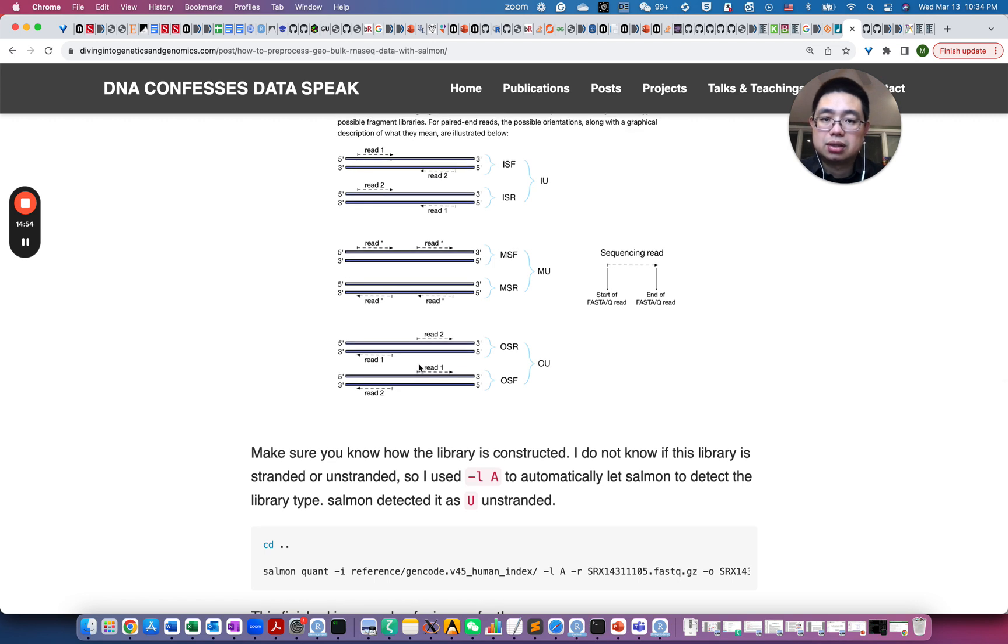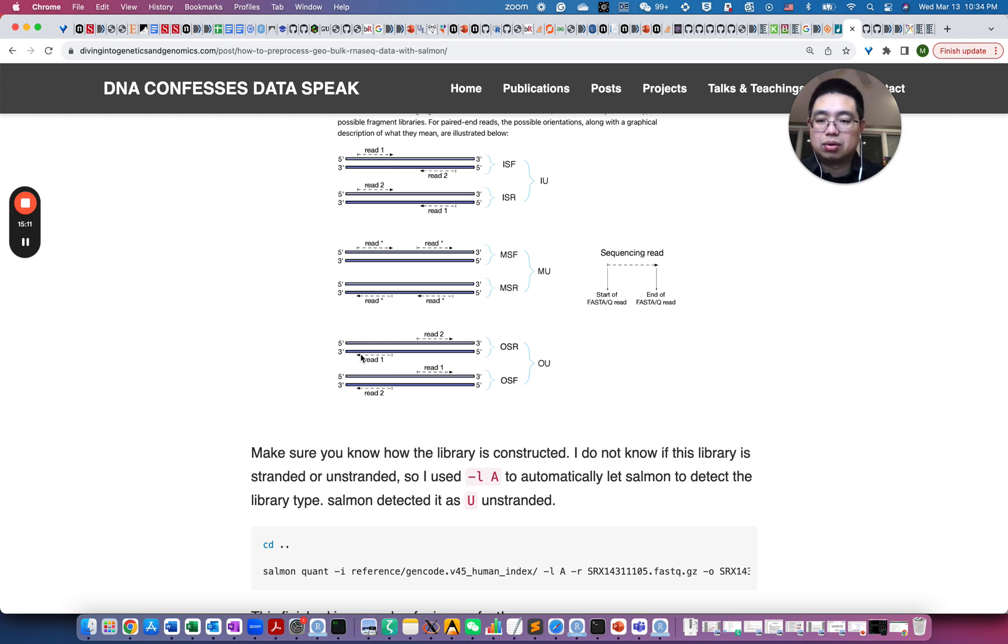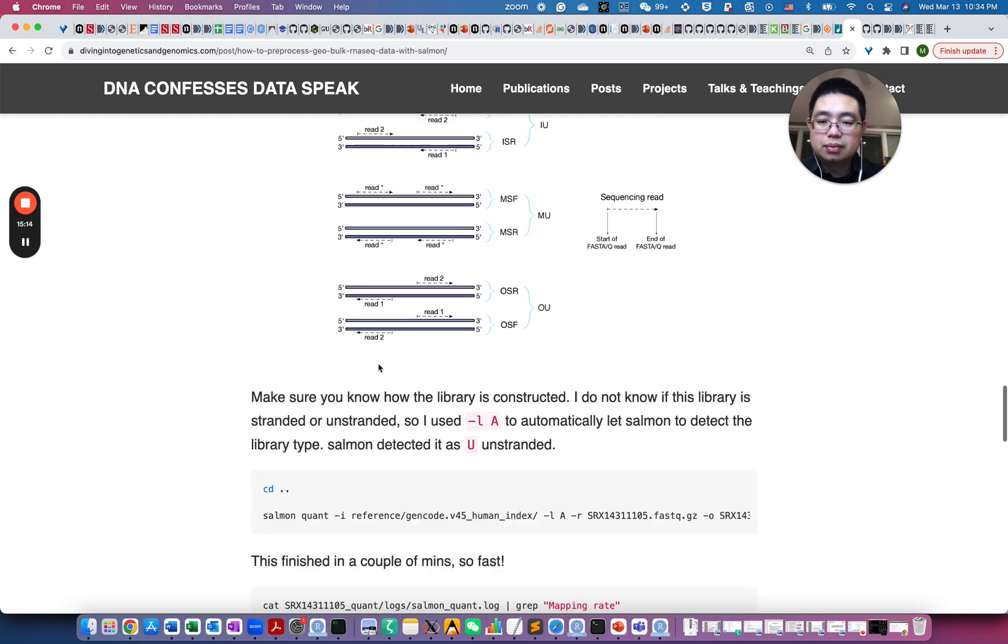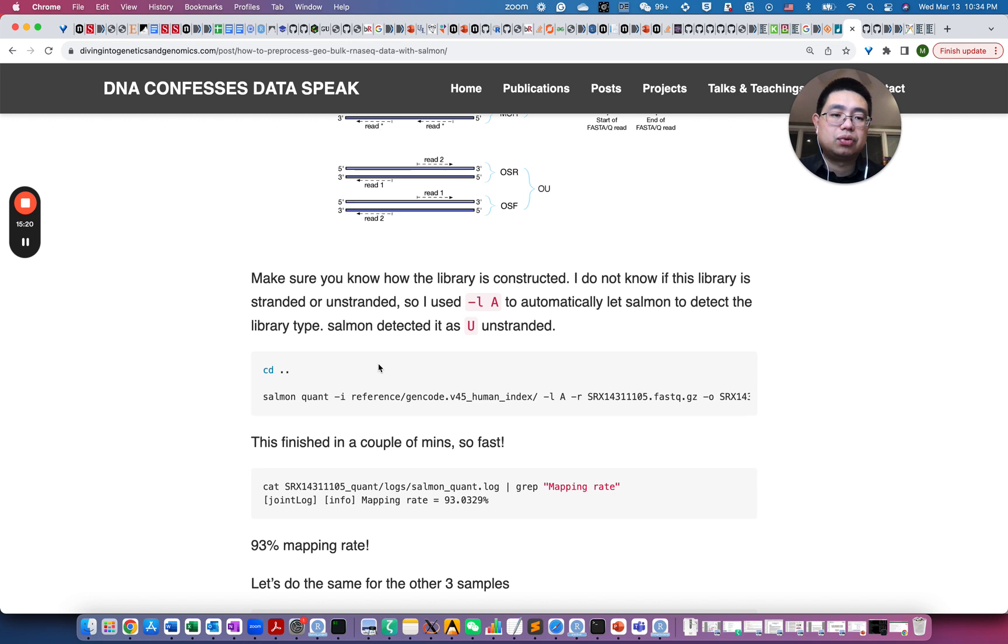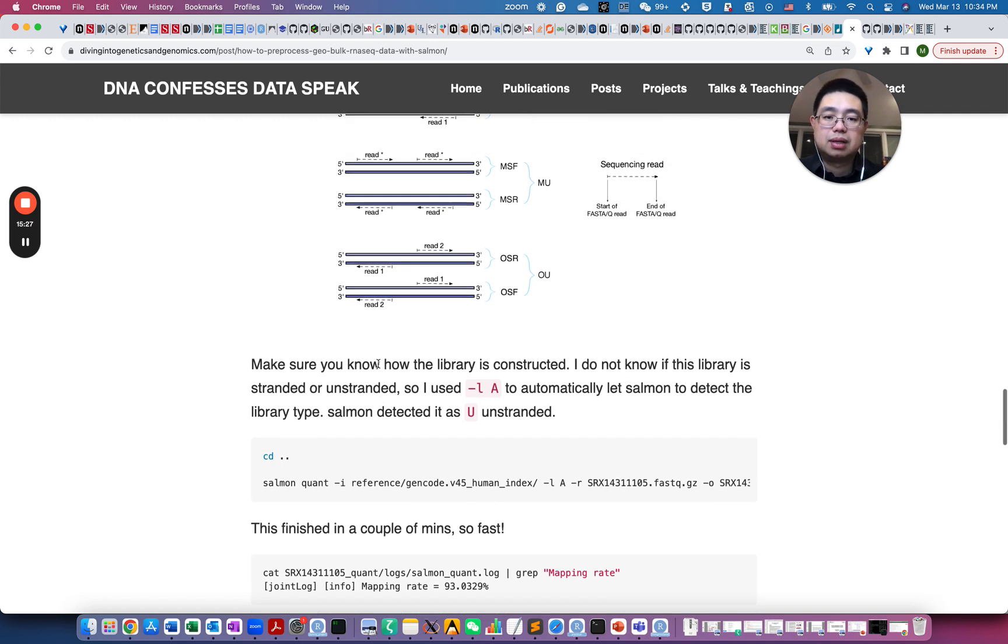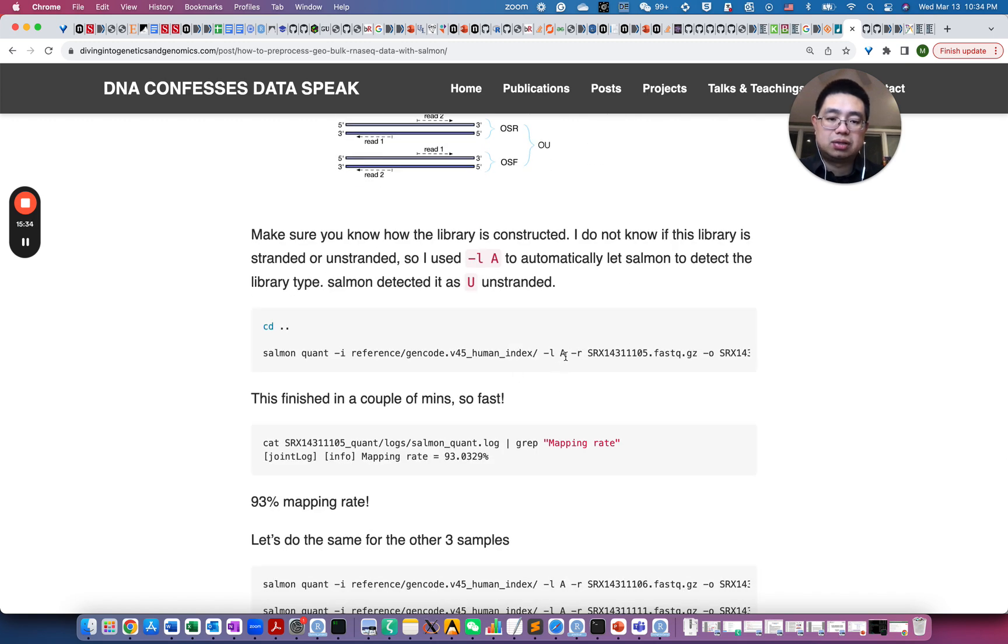And you can also have, for example, like this thing, so essentially you have the read two actually from still read two from the sense strand, and R1 from the anti-sense strand, but read one, it's more close to 3 prime here. So make sure you know how the library is constructed. So if you don't know, you need to ask the wet biologist who actually made the library, so they will tell you how the library is constructed, so you can specify the right arguments for Salmon here.